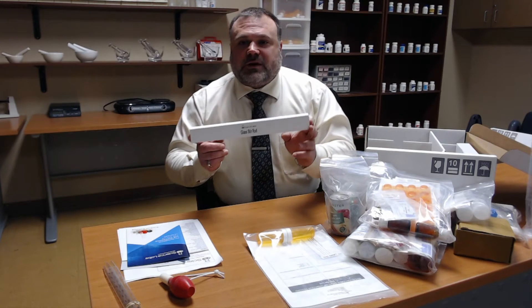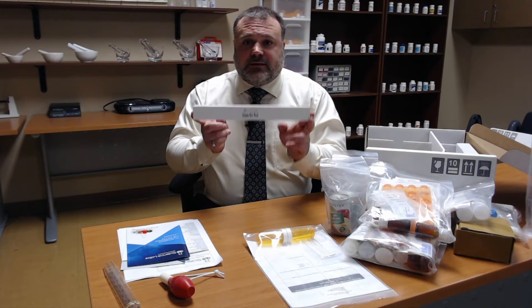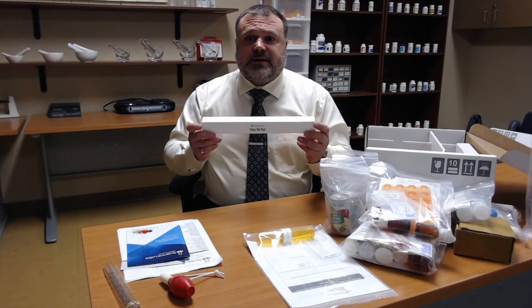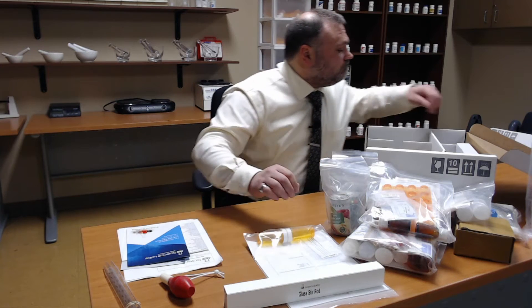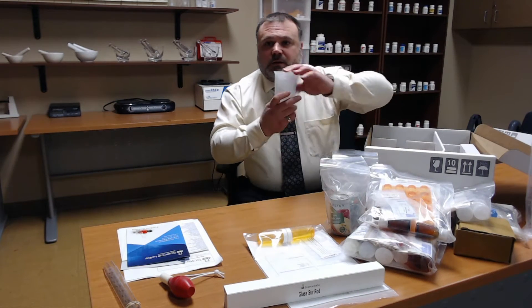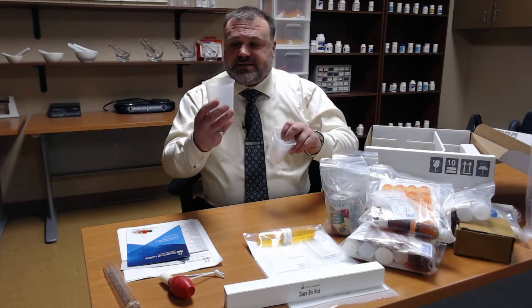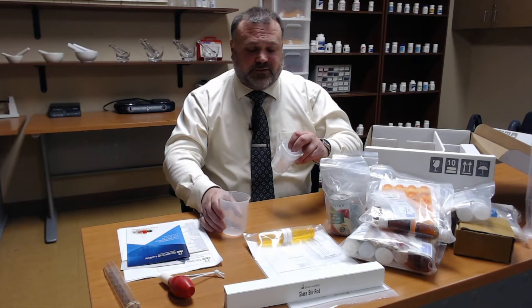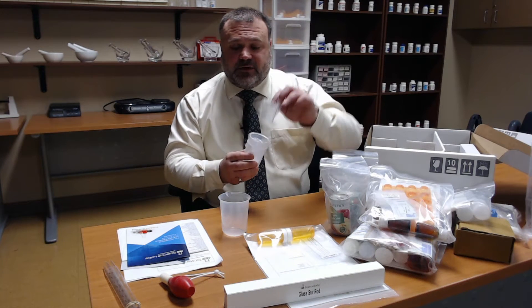We have our glass stir rod. This allows us to accurately and completely dissolve our substances in the liquids as we're performing our compounding. We have polypropylene beakers that come in various sizes: a 250 milliliter beaker, 100 milliliter beakers, and 50 milliliter beakers.